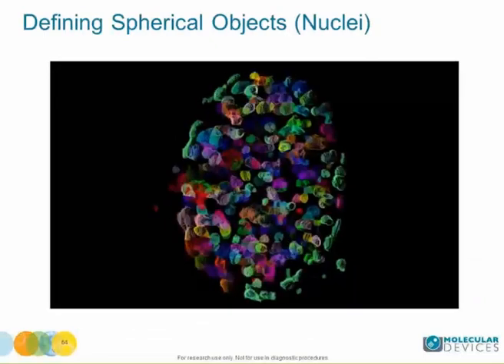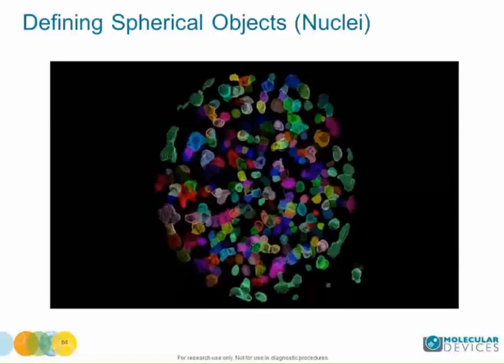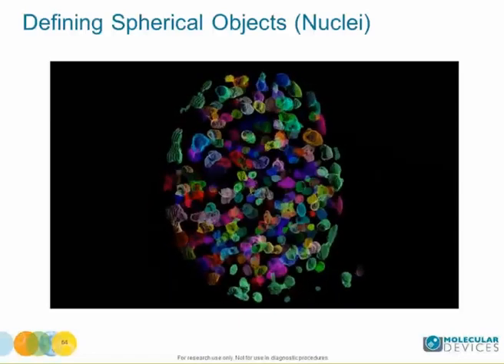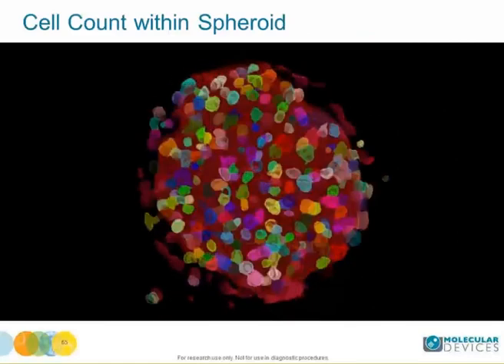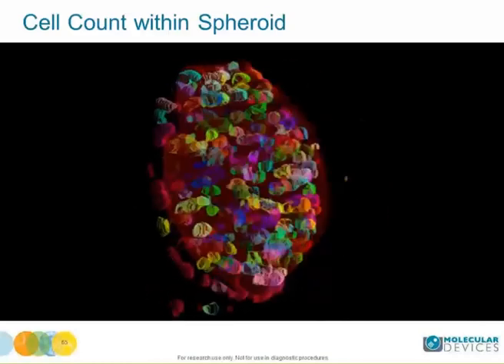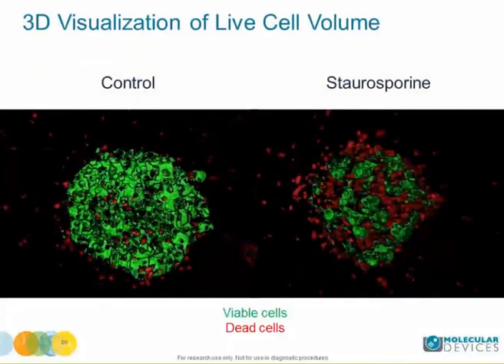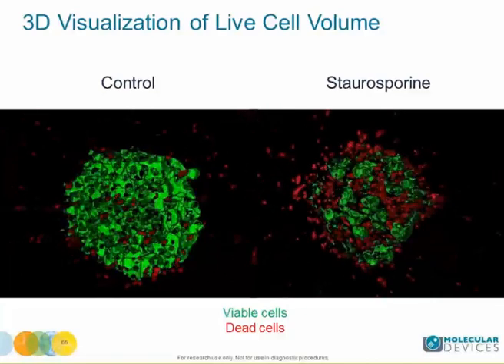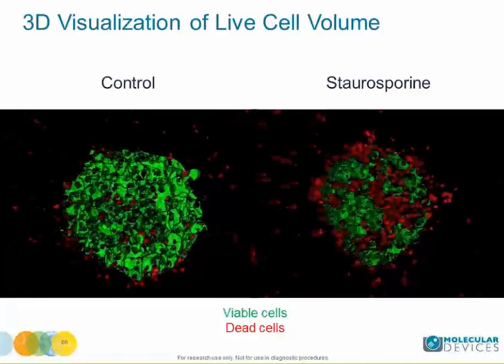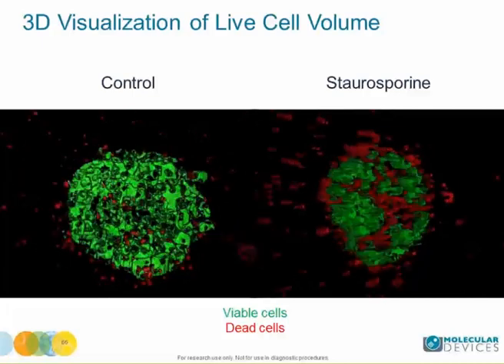3D analysis allows converting information about cell segmentation into 3D space. Nuclei or individual cells can be counted or characterized within larger objects, in this case the spheroid. It is also possible to characterize and score cells for live and dead using calcein staining, and also define not only the number but also the volume and volume sum of cytoplasm of cells positive for calcein.